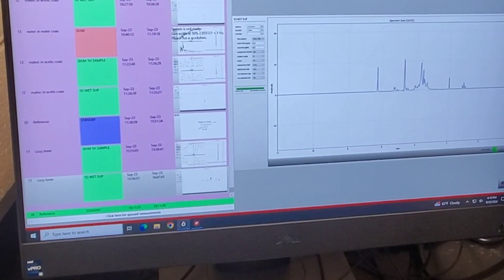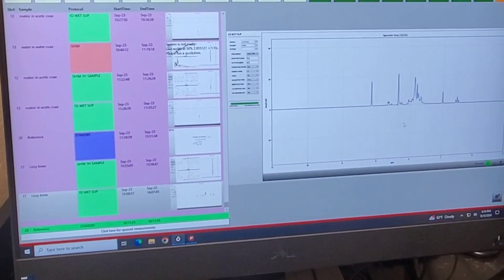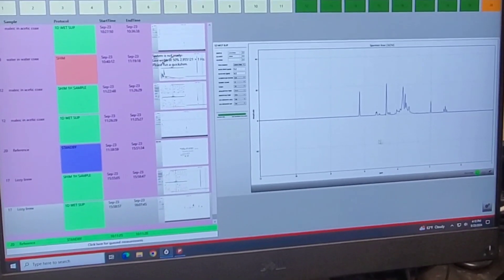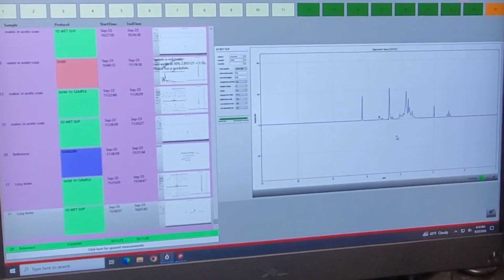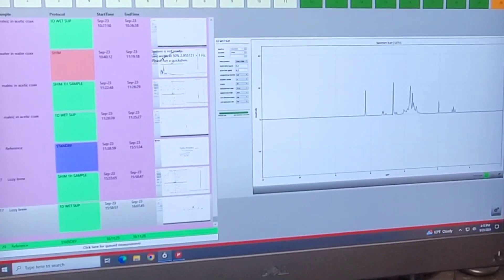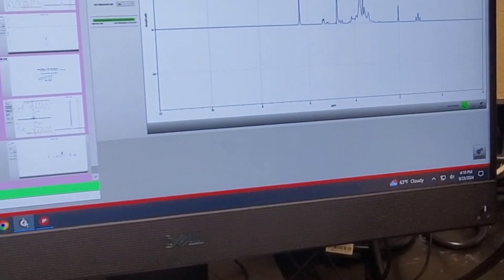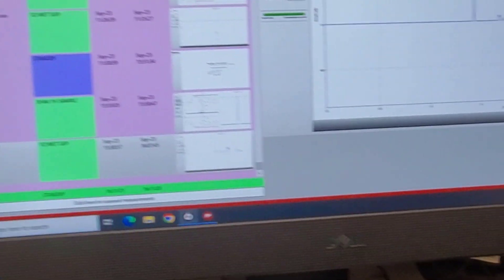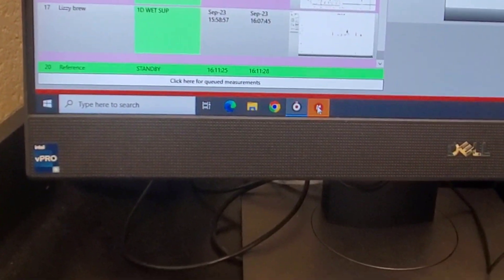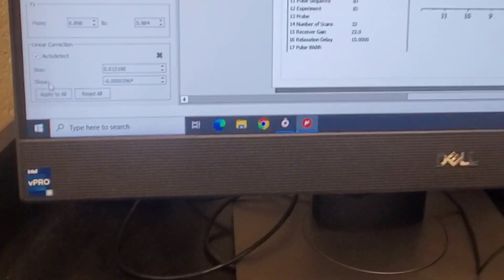Time has passed and now we have a completed spectrum of our kombucha. We can't analyze the spectrum in the Spinsolve software — we have to go to the MNova software, which is this little icon at the bottom. We hit that, and it brings us into the actual software for analysis.